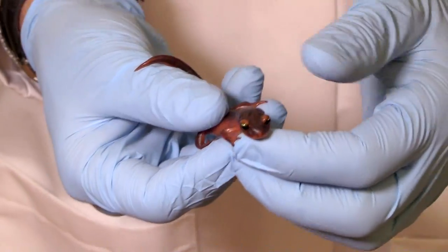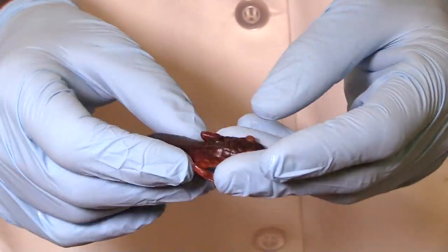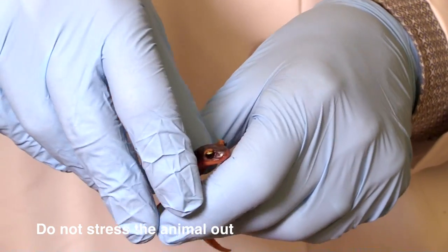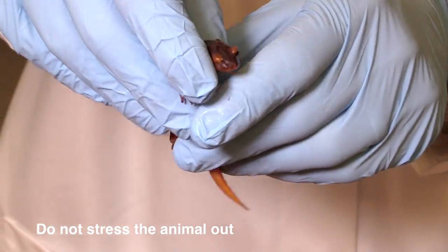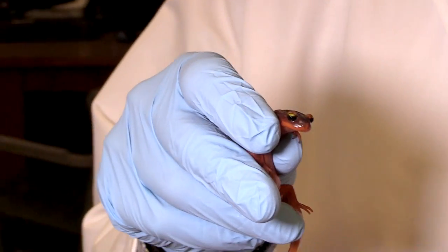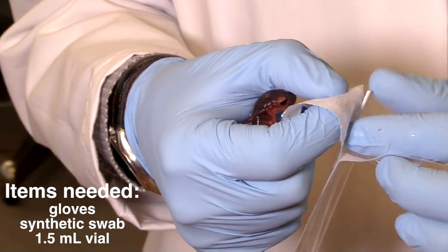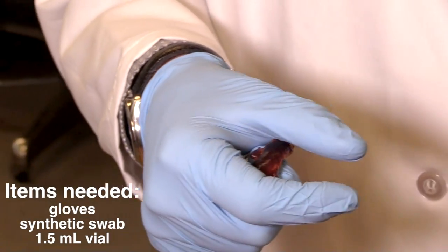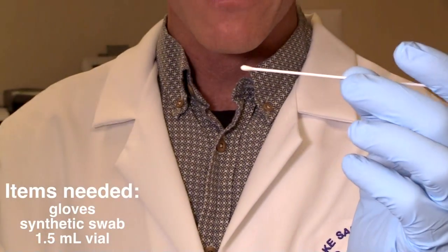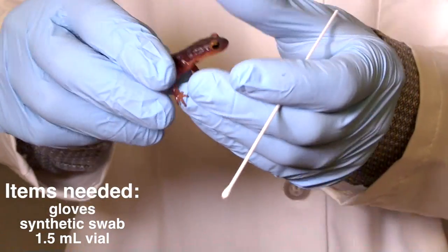This animal does not like me to hold it upside down, so we want to do whatever we can when collecting these data to not stress the animal out. I'm going to hold it up like this and swab from the bottom. To do this, I need a pair of gloves, which I already have on. I need one of these special swabs — it's made of synthetic cotton — and then I need a vial, which I'll use in a second.